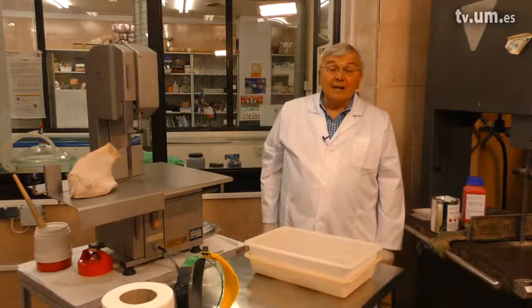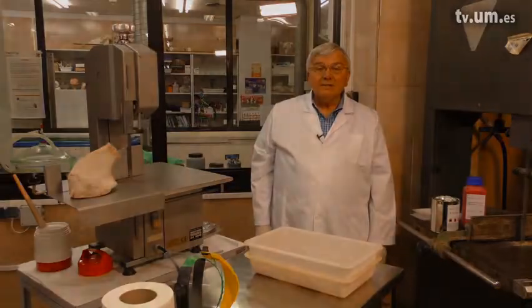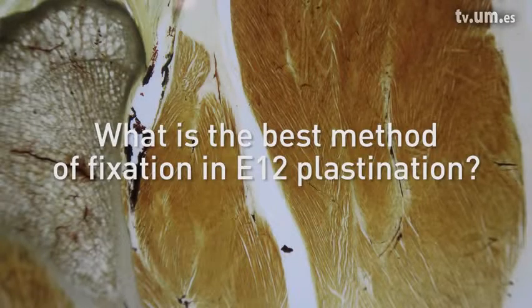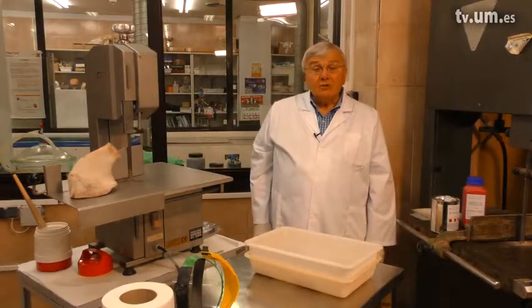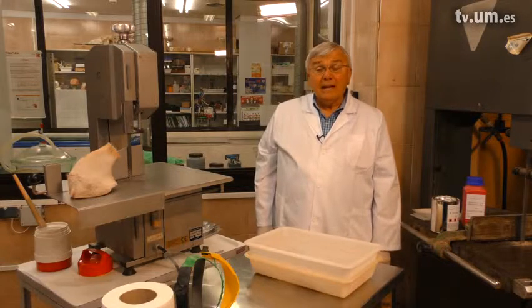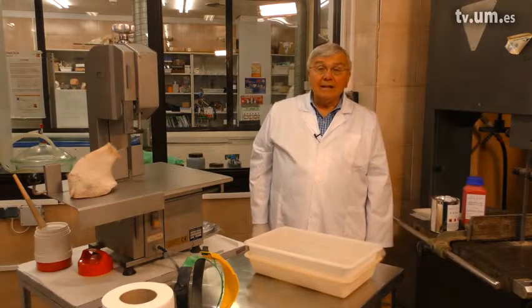For E12-plastination, either fixed or fresh tissue can be used, but fresh tissue makes the best-looking specimens. For fixation, we use formaldehyde — 10% formaldehyde, pure formaldehyde with no additives.